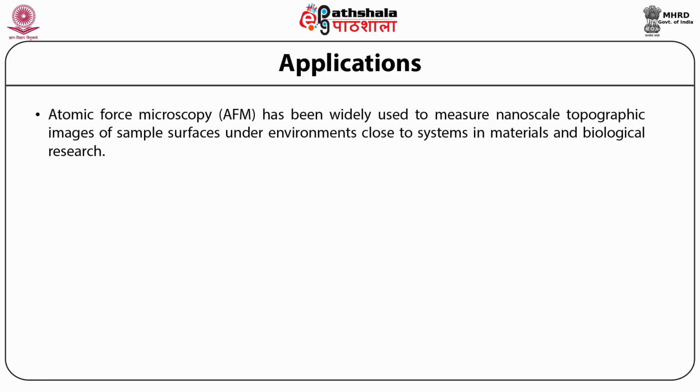AFM has been widely used to measure nanoscale topographic images of sample surfaces under environments close to those of systems in material and biological research. In AFM, a very sharp tip made of silicon or silicon nitride, Si3N4, is used to probe local information on the sample surface.